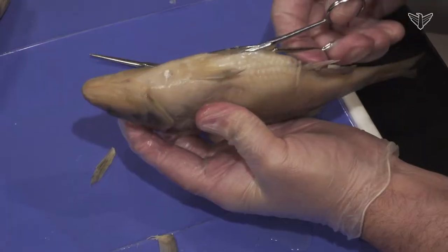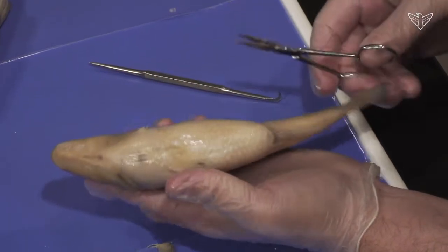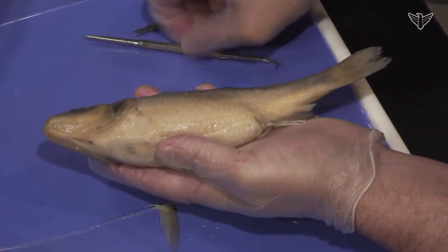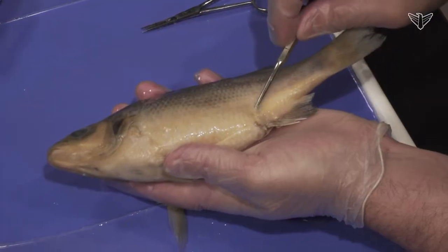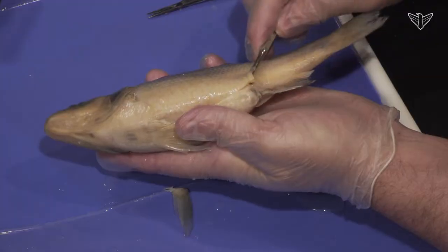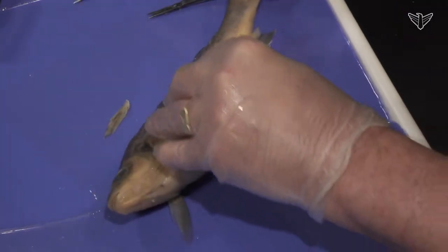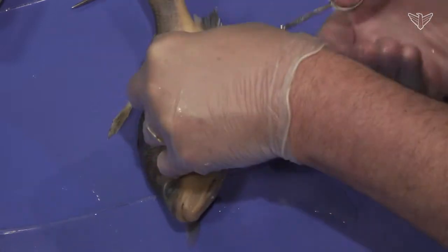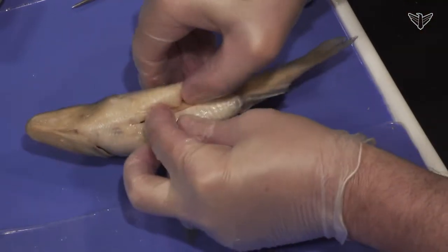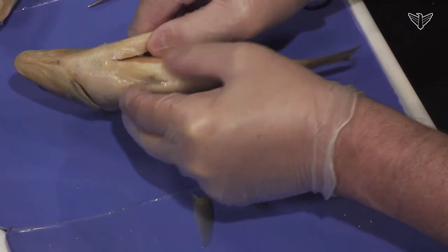Go along the belly, up at least through that girdle where the fins are — there would definitely be a cavity in there we're looking for. You can kind of see here we are breaking that open. There's definitely a cavity there we're getting into, this big body cavity, this big coelom that these animals have.